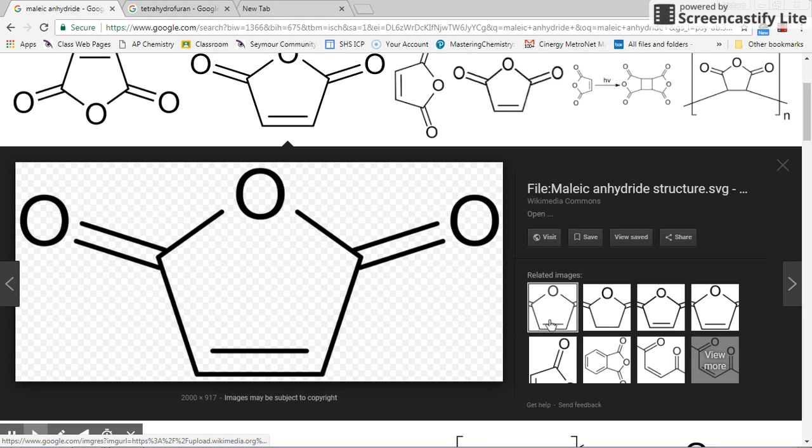What we're going to have to do at that point is a titration. And the titration is going to give us what are called the equivalents of hydrogen. And based upon that, we should be able to determine which one of the choices near our melting point would be ours. So we have to talk just a moment about that.